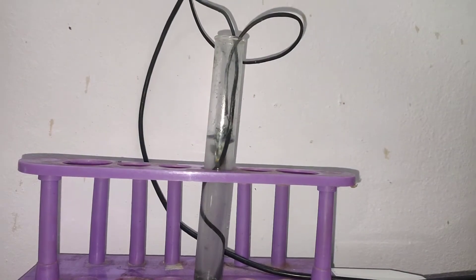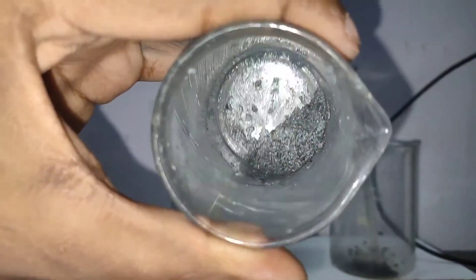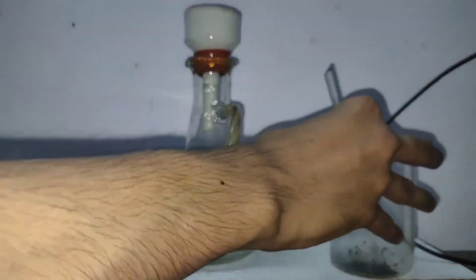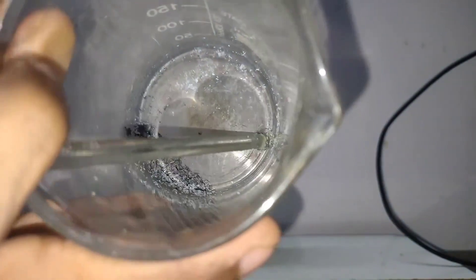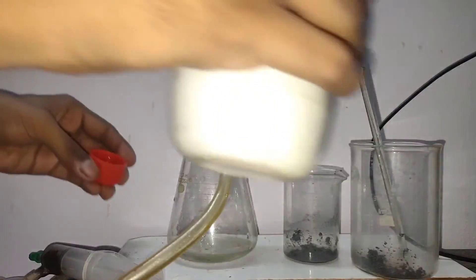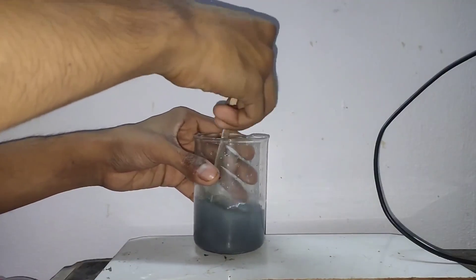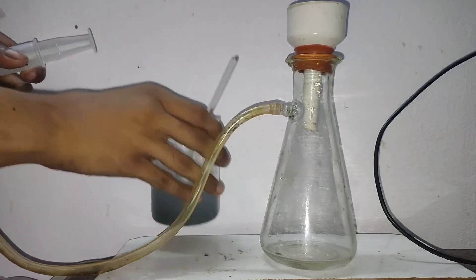Then I started electrolysis again by putting in a new anode to get more crystals. The second time I got these many crystals. These are the crystals I got in the first run, and now I will combine both batches, wash them, and filter them using my Buchner funnel.